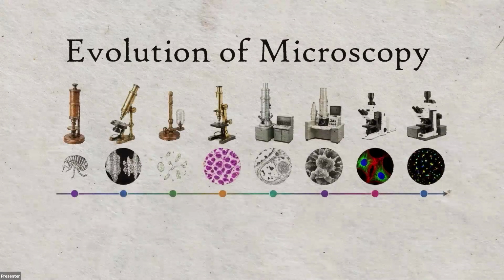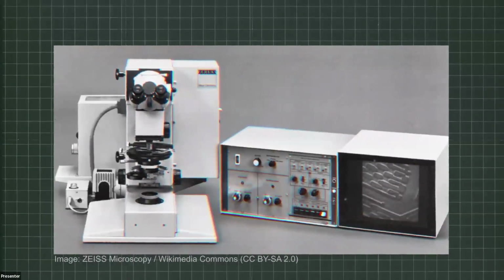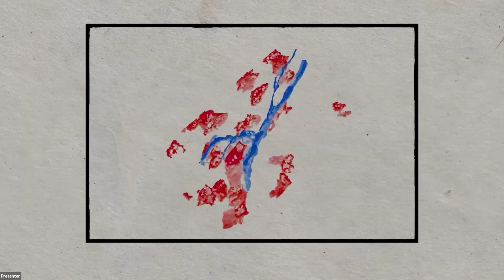So how do we go from taking the 2D single Z-plane protocol to 3D? 3D imaging is not a new technique. Confocals and 2-photon imaging have been around for decades, and it's frequently used by the cell biology and neurobiology fields. But something happened in the year 2018.